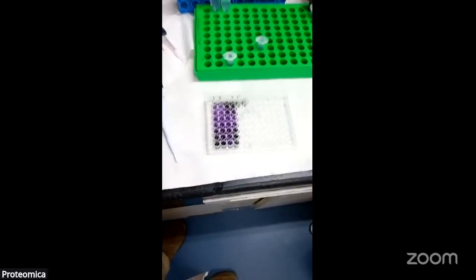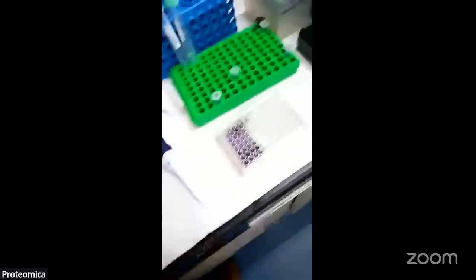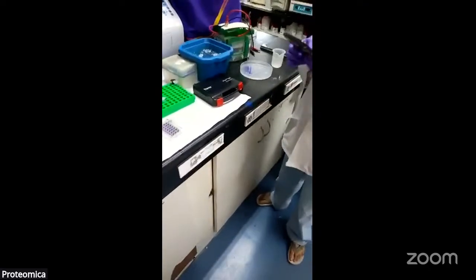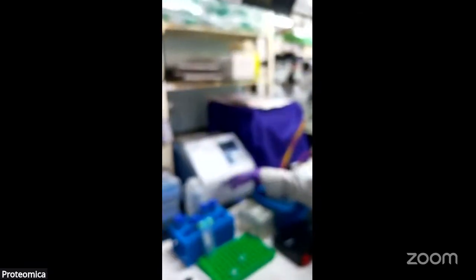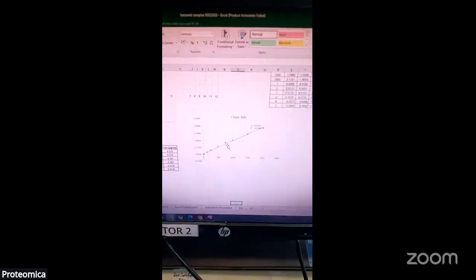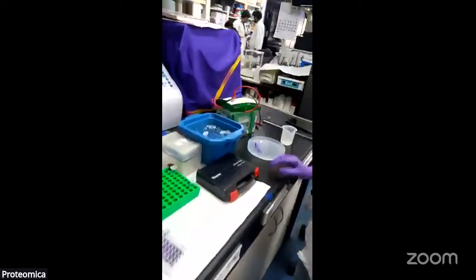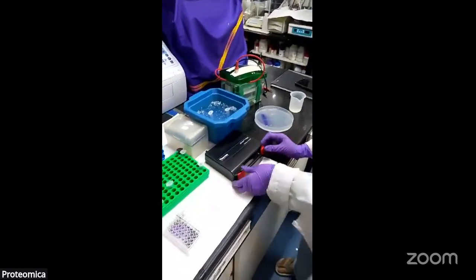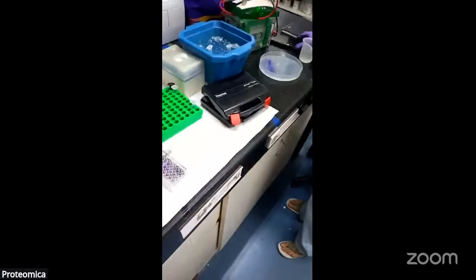We have already prepared a gel, and based on the colorimetric assays, the Bradford is determined. My TA Khushi will tell about the Bradford assay. We use this data, and this is a graph, and for this the R value is 0.99. Once the Bradford is done, we will next initiate with the sample digestion. We will first initiate with the reduction and alkylation process.